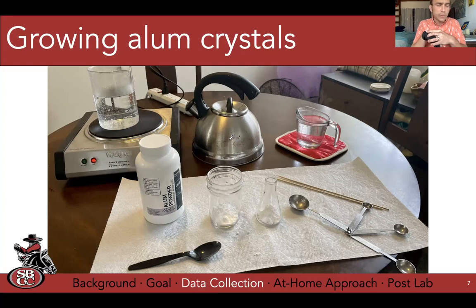By the way, a baseball has an average diameter of 73 to 75 millimeters. You want to keep track of that in your mind. And then also I wanted to grow a really pure crystal, and those paths are a little bit different. You're not going to need very much, but how you execute your experiment can be done in so many different ways. But you're going to need hot water, 100°C water.